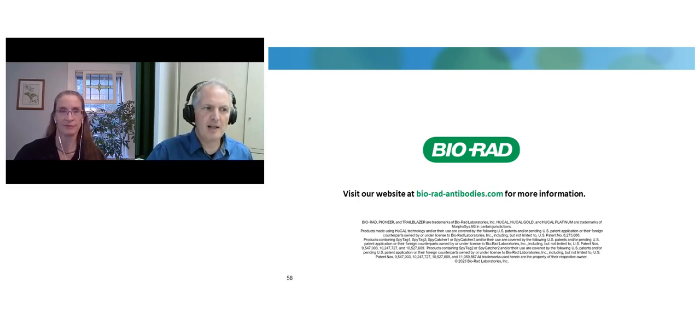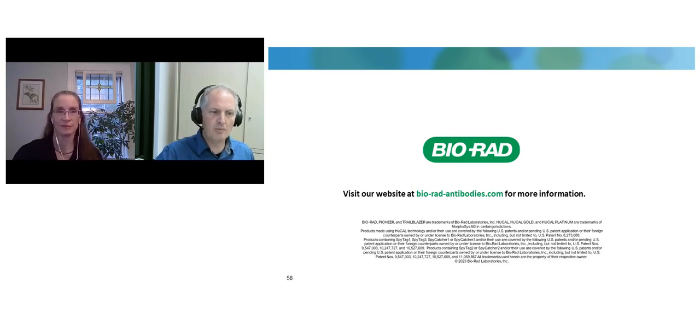The display rate is lower than in SpyDisplay. I mentioned a monovalent display, which basically means you have more empty phages with this display than with SpyDisplay, and empty phages can stick to your antigen and are unwanted. Yeah, there are some more topics, but these are the main ones.